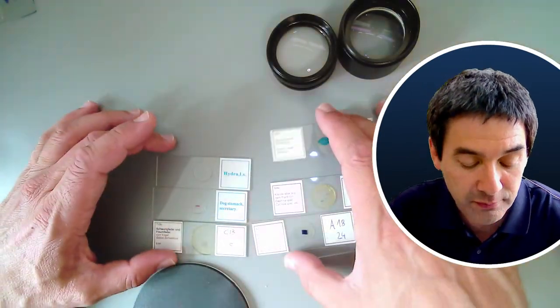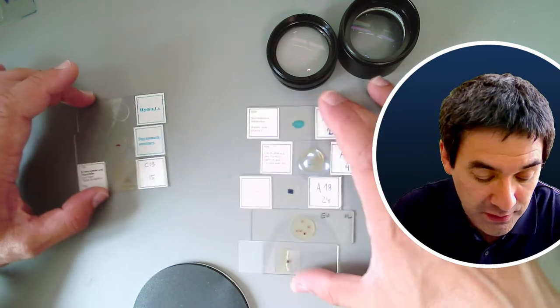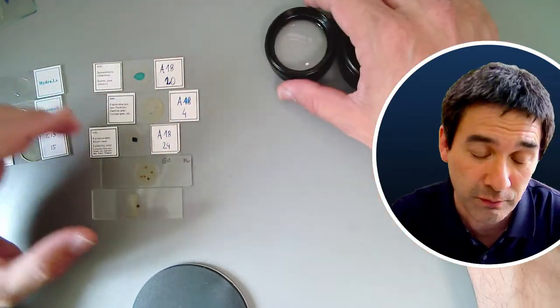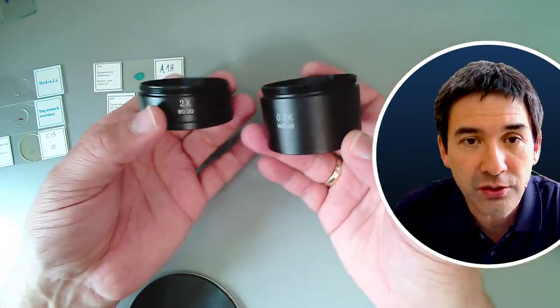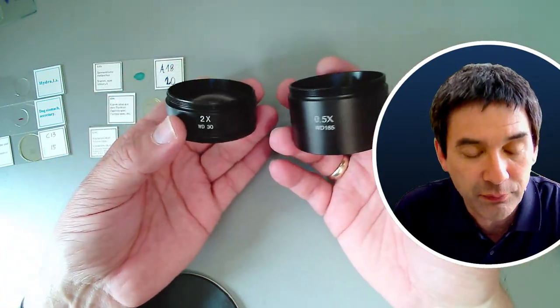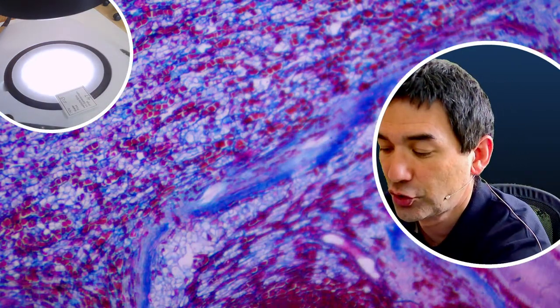Before looking at slides, I would like to show you my stereo microscope, which is fairly new. I also want to show you these two Barlow lenses, which I got separately and can attach at the bottom of the stereo microscope. Now switching over to the stereoscope — I've already put a slide on here. Let me show you the light intensity. This is basically the stage, where you normally put opaque objects.